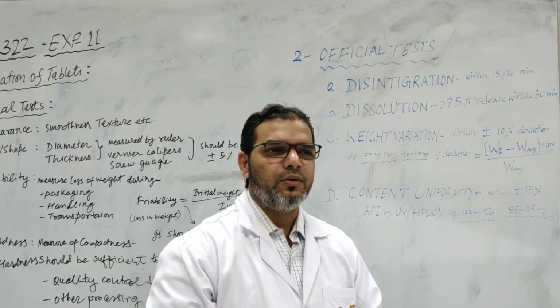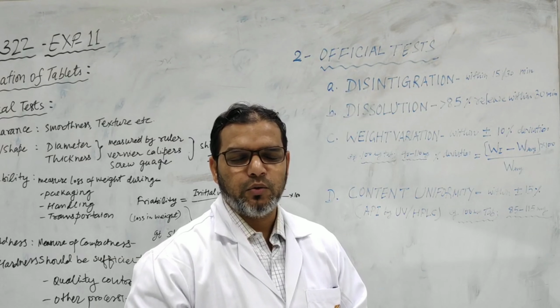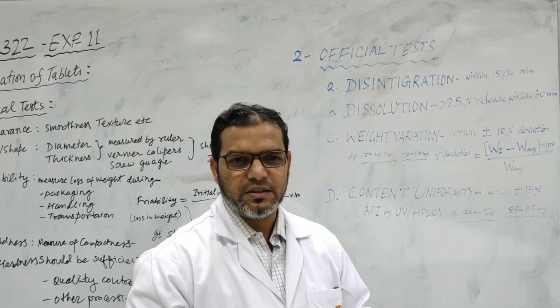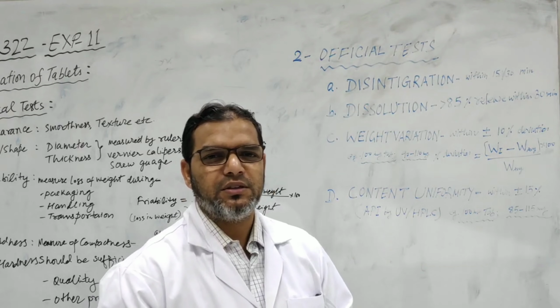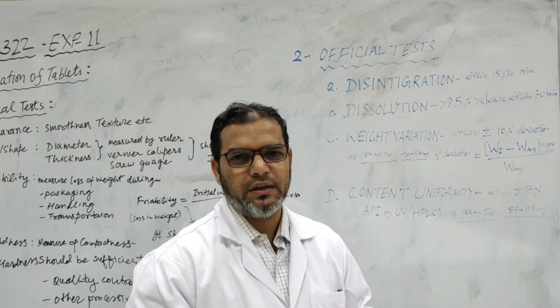If you have an enteric coated tablet, it will take more time, and you are going to use 2 different media, HCl first, and then you replace the HCl and put it into the phosphate buffer. Otherwise, normally you take just one medium, HCl, or even water can be taken. Okay, so these tests you are going to take at the next level.